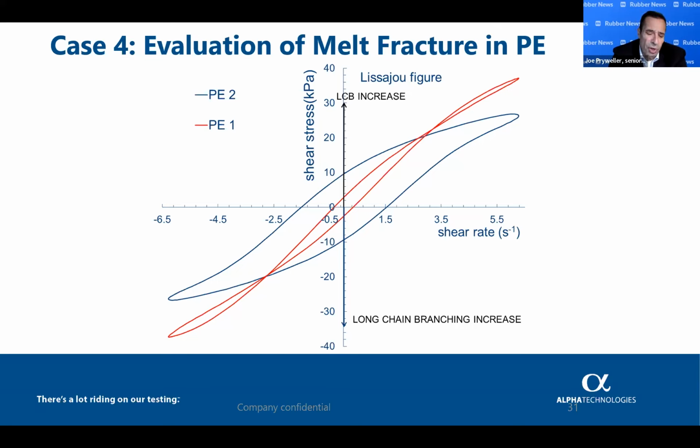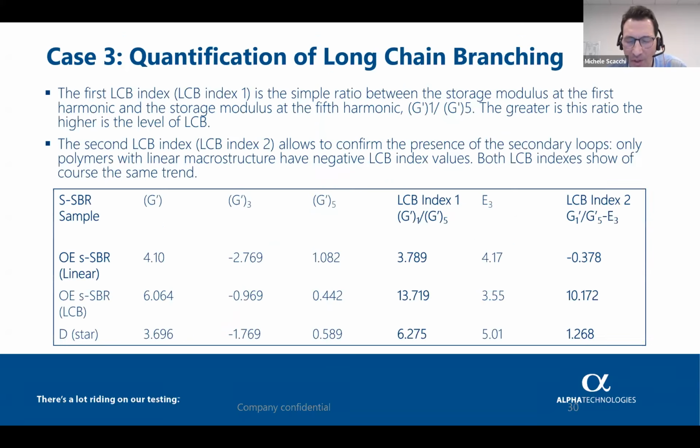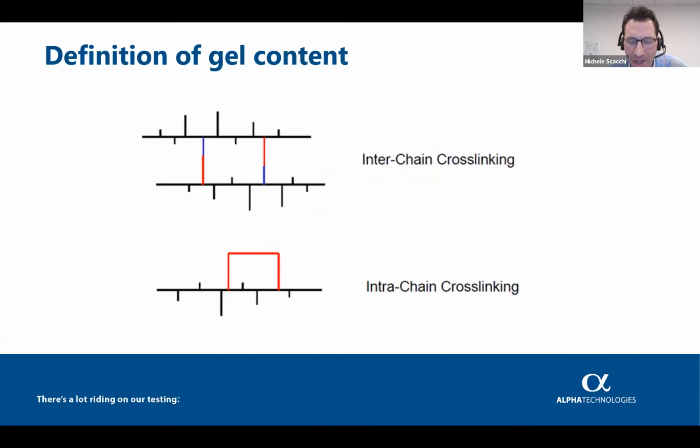Could you elaborate further on the onset of melt fracture and how LAOS can best attack that kind of branching? I think we're talking about case study number 3, right? The melt fracture was a processability issue that should be avoided.